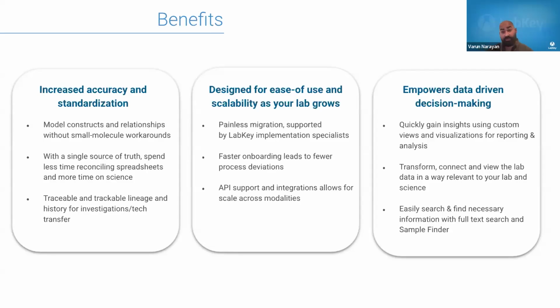It's designed for ease of use and scalability as your lab grows. So it's easy to migrate, it's easy to learn, and it's easy to continue using even as your lab and needs grow and shift over time.